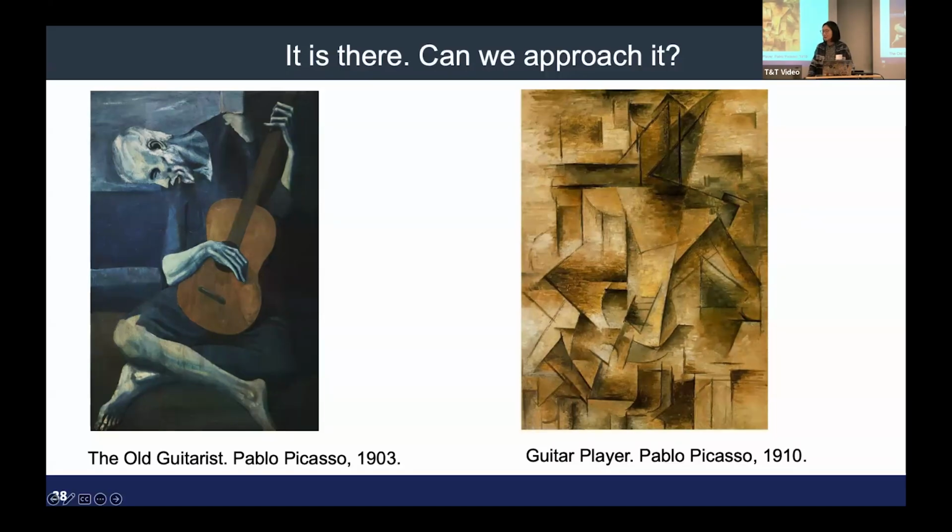Yeah, for neuron subtypes, the quick answer for our data is that we cannot distinguish them, because excitatory neurons also have GABA when they're immature, and we cannot differentiate which is an immature excitatory neuron having GABA or an inhibitory neuron having GABA. We only have 25 antibodies.